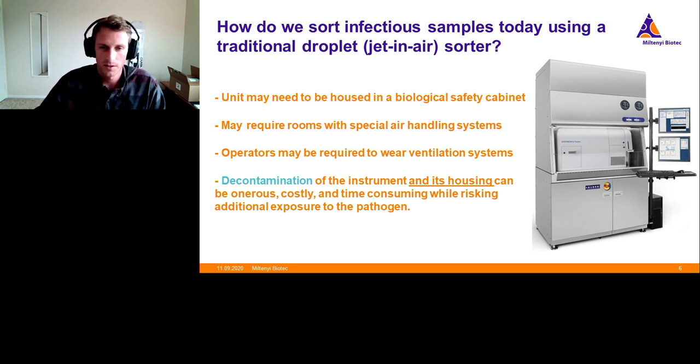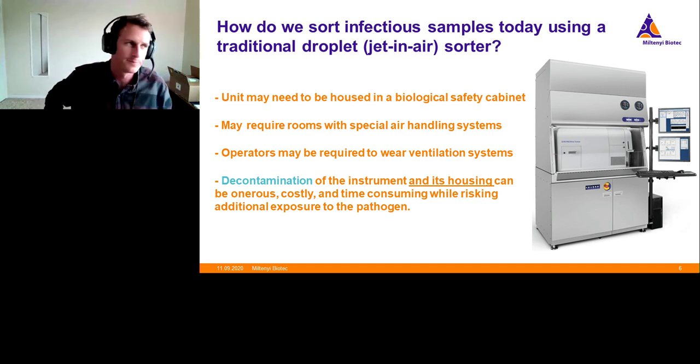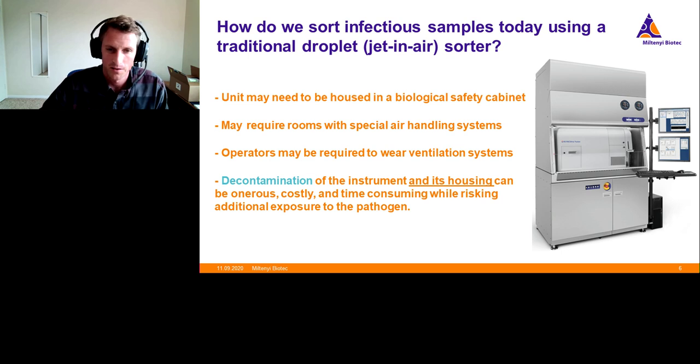Obviously, microbes in shared fluidics lines pose the risk of contamination of future samples, but I think it should be fairly well understood that working with a system that deliberately generates aerosols of hazardous material just doesn't feel good. And so I think that's all I'll say about the systems for now. I think I've made my point there.